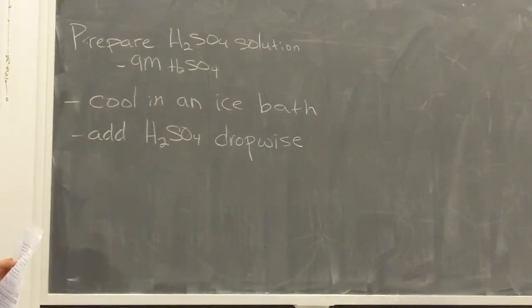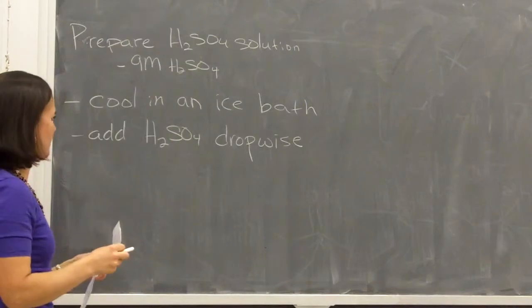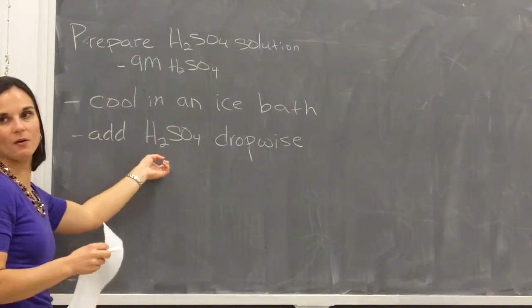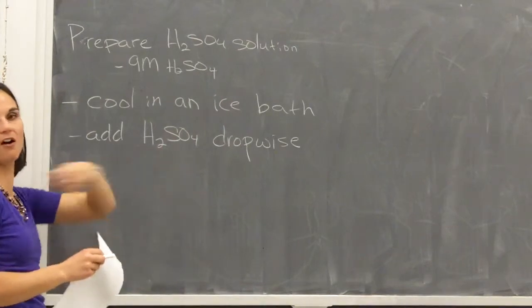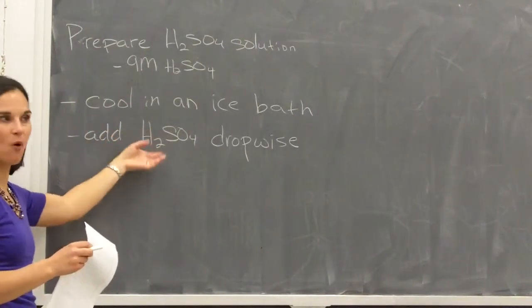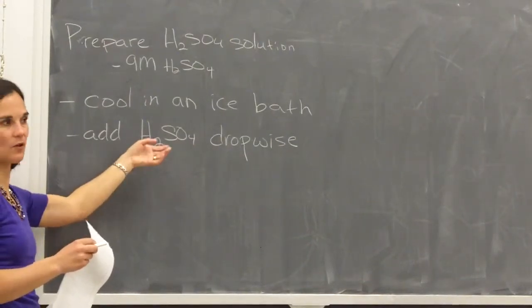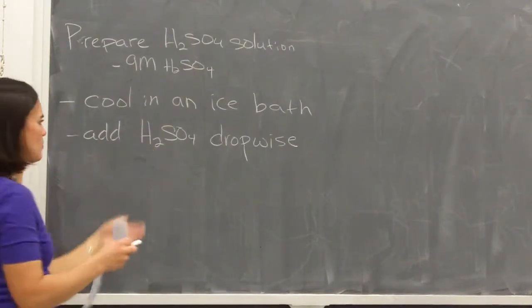You're probably going to see any residual magnesium that you have reacting with it. You may see H2 gas being given off as it's reacting. But do keep control of this quench. A lot of times people get to this point and think, oh, I've made it, and then they go too quickly with this part. You've got to be just as careful with this as you've been all the way through, okay? Now we have made up a solution with water. So now we are adding water to the reaction. So at this point, it is okay that water is going in the reaction during the quench, all right? So finally at this point, if water got in here, it's okay. Any time before this would have been too soon.